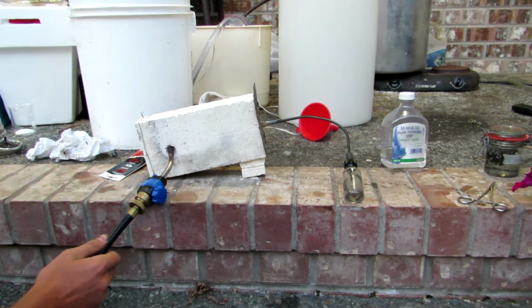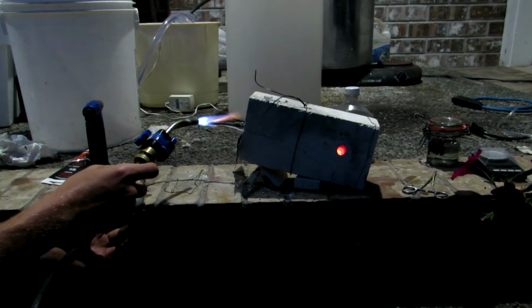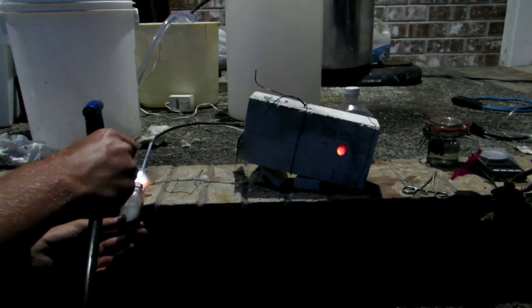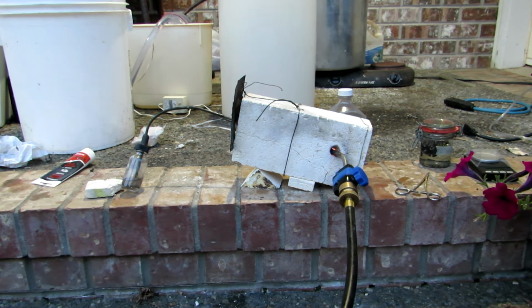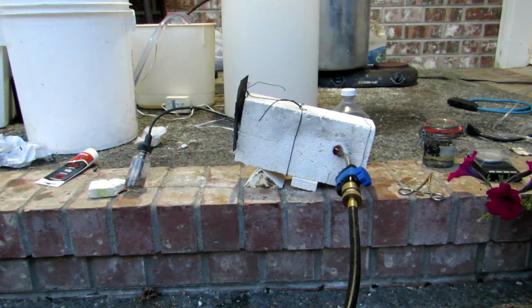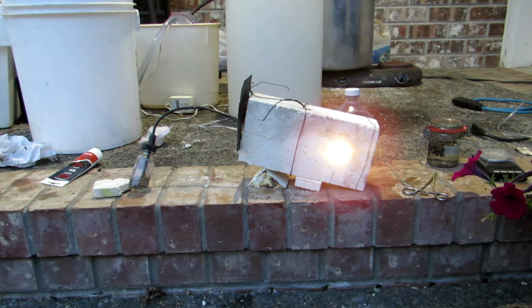To initiate the reaction, a blowtorch was placed in the side of the refractory brick. As everything heated up, the brake line was occasionally heated to ensure it stays above potassium's melting point of 64 degrees Celsius. As the temperature increases, lithium reacts with the potassium chloride to produce lithium chloride and potassium metal, which then distills over through the brake line, condenses, and is forced into the vial. Lithium is a very strong reducing agent and can even reduce other alkali metal compounds to the pure metal.